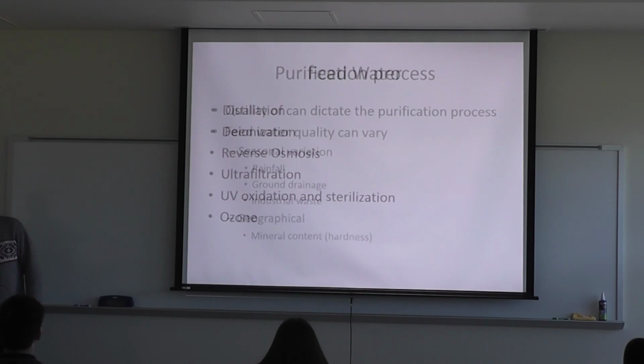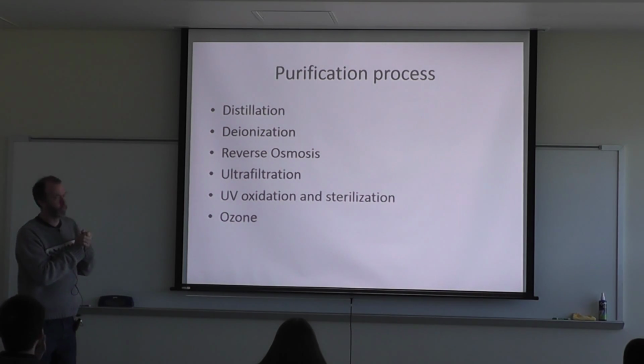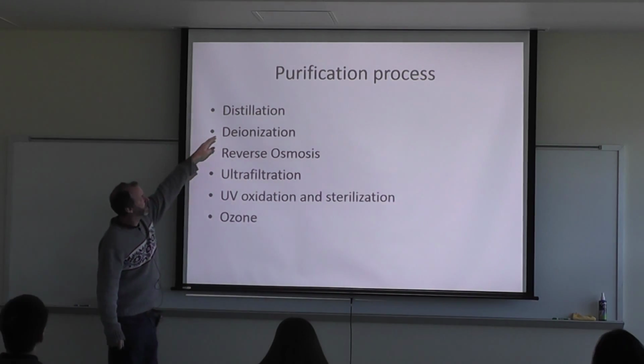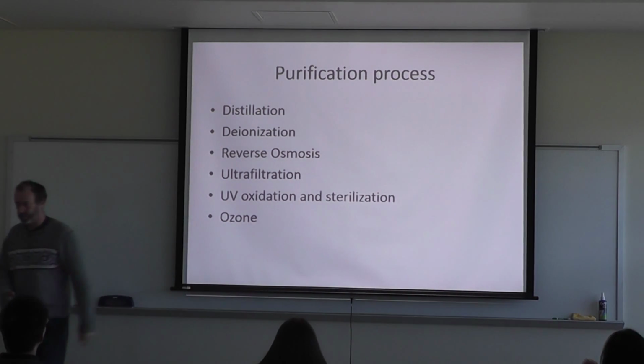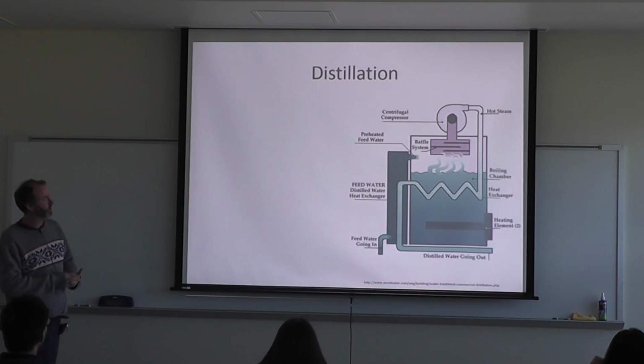Purification processes, there's a number of different ones, and they're all good for different things. None of them purify the water completely. We have distillation, deionization, reverse osmosis, ultrafiltration, UV oxidation and sterilization, and then ozone treatment of water also. So this is your basic distillation setup.